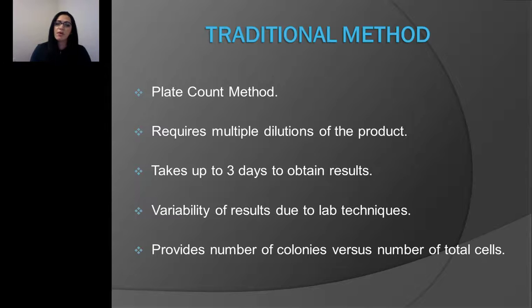Some products might require fewer or more dilutions than others. It usually takes 3 days. In those 3 days, you are able to collect the results, and that will let you report the counts. So the product is ready to be manufactured at that point.